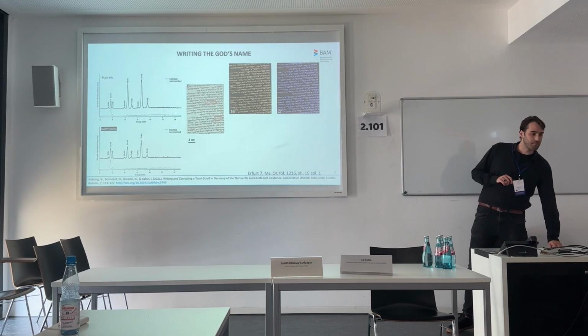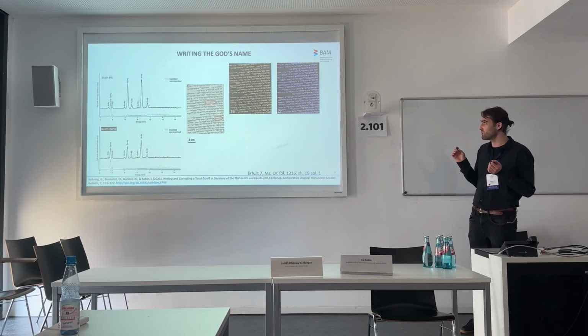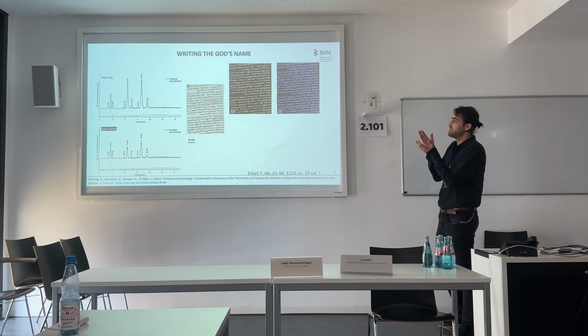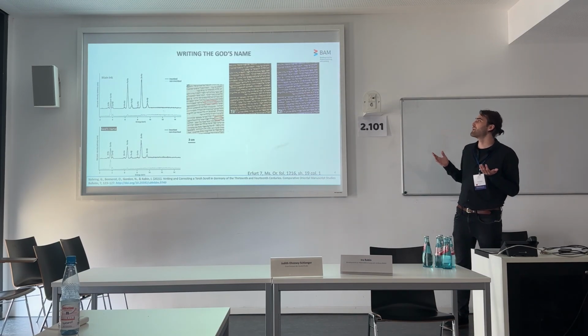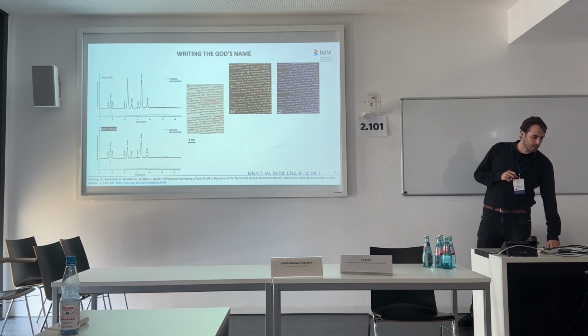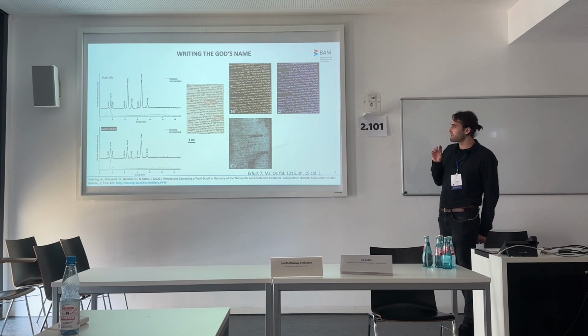However, since we used an imaging XRF, we were able to produce maps of elements. Let us focus now on what we see here. When we look at the maps of iron and zinc, we basically see two mirror images. Therefore, it doesn't give us much information. However, when we move to the map of calcium, we start to see some interesting patterns.